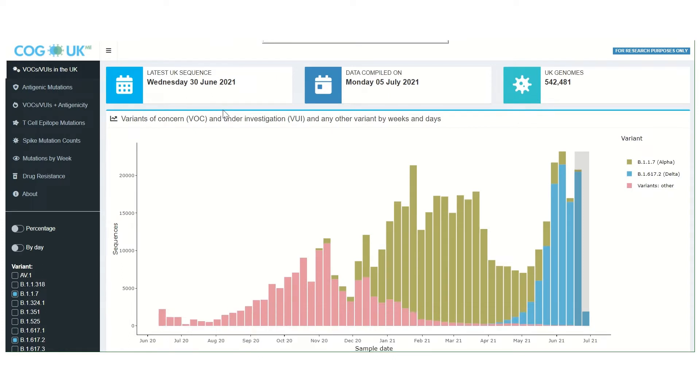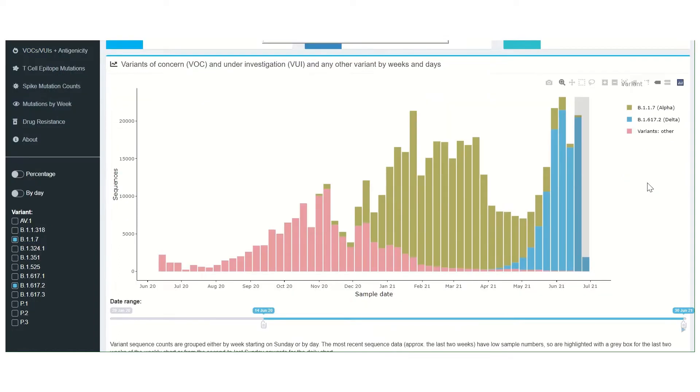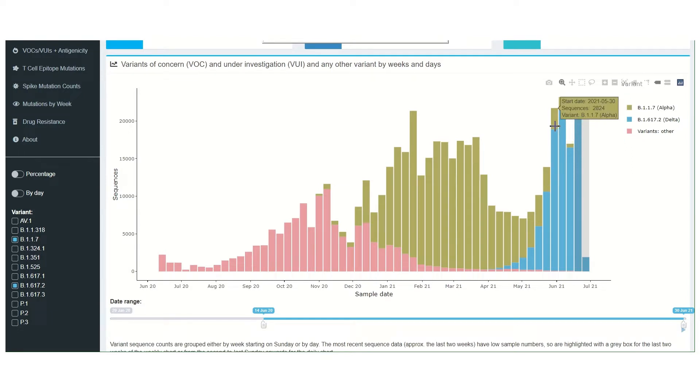The graph at the top of the page shows which variants are present and at what levels in any given week. For example, we see that the delta variant dominates in the week starting 30th of May, and there are also high levels of alpha.